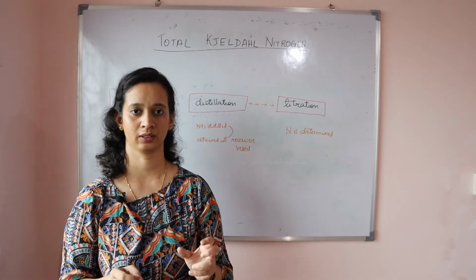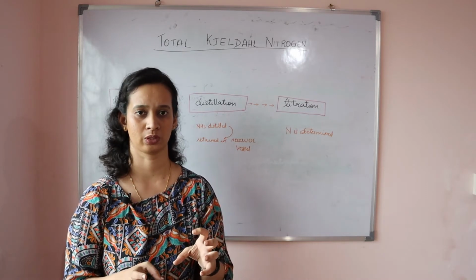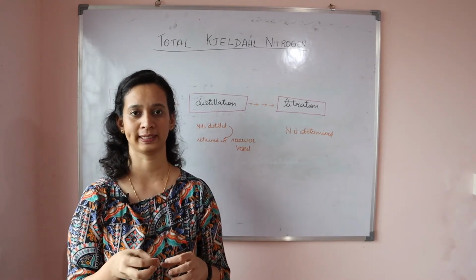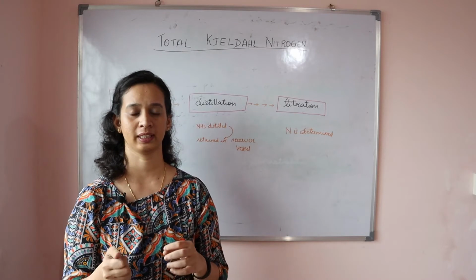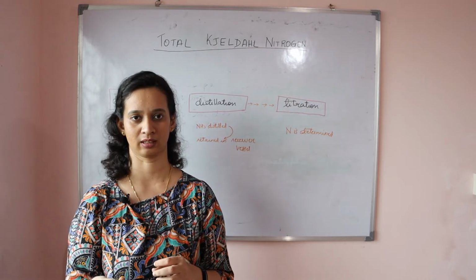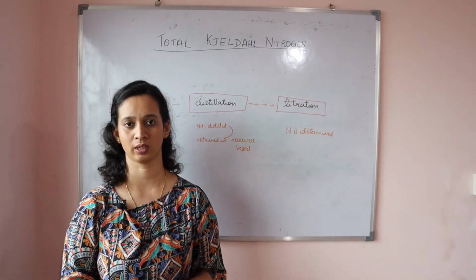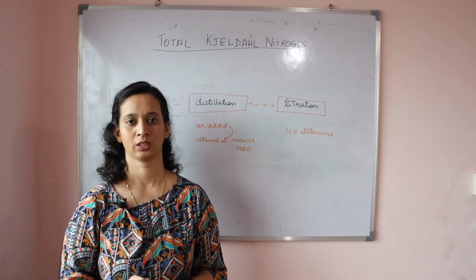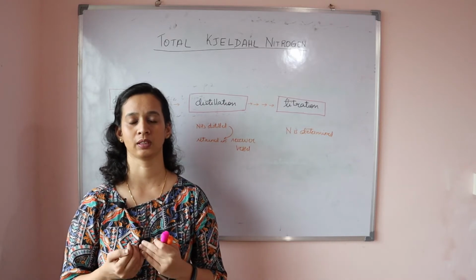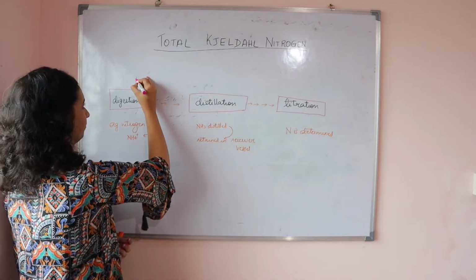Now here sometimes selenium or titanium can also be used. Copper sulfate is slow to digest. But other mixtures containing titanium and selenium often result in generation of hazardous gases. So that's why we are using this mixture. All the nitrogen that is broken down gets converted into ammonium sulfate. So the nitrogen gets converted into ammonium, which is then processed by the distillation unit. So now we are done with this step.